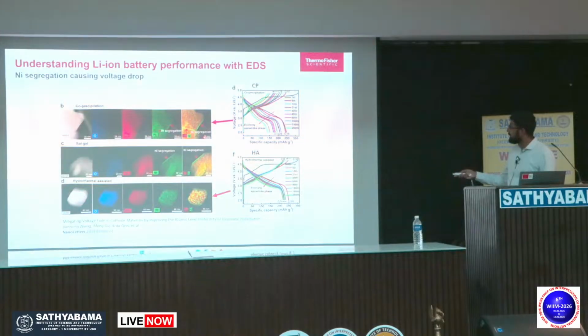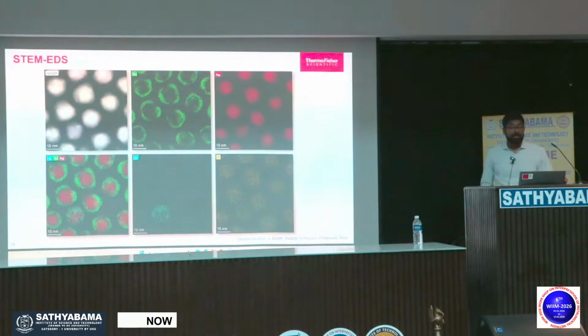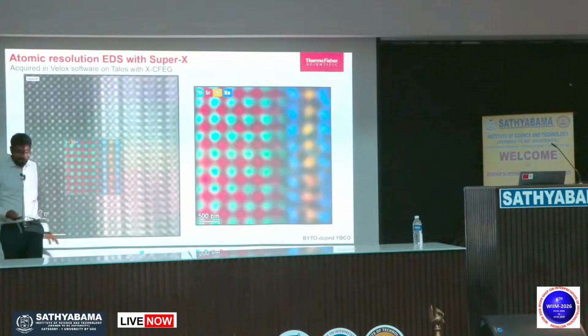The segregations, you can find core-shell structures. You can see particles, and you can find how the cells, nickel and silver, how the core-shell structure looks like here. Further, you can have the interface. These are the atoms. Here, these are dark sides, so this is the interface, and there is dark, and even darker. So this is the interface, each atomic column.